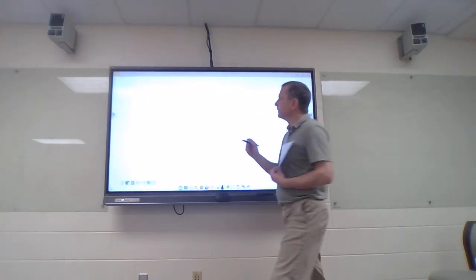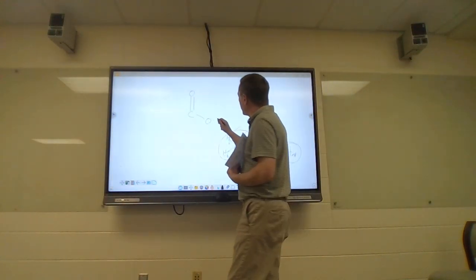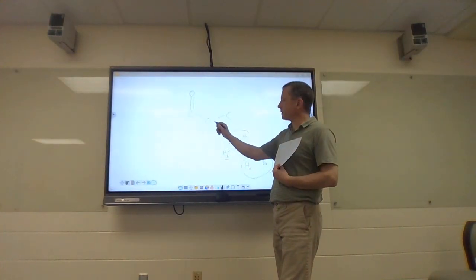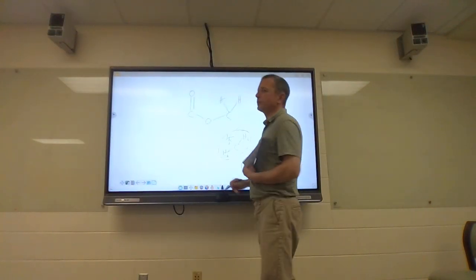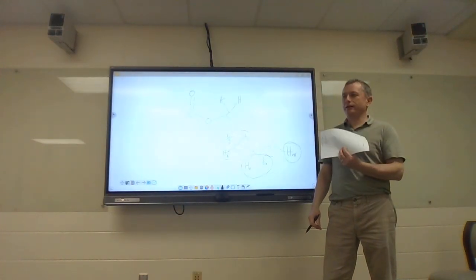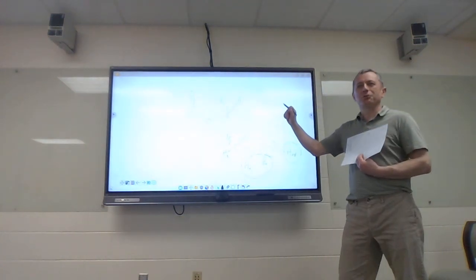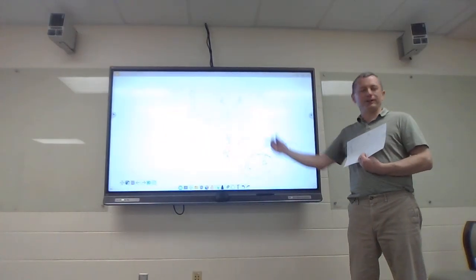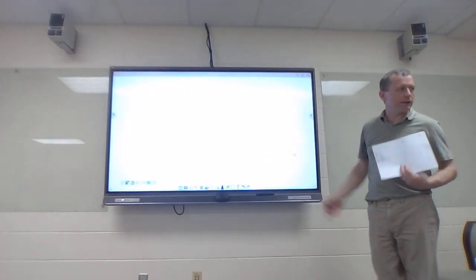If you look at your chemical shift table, hydrogens on a carbon next to an oxygen, next to an ester here, are almost always right around 4. Kate's gotten to see that quite a few times, except it's not this, it's a methyl. So we tend to see a big singlet around 4. That's our ester. We know that every time. It's always there right around 4. It shifts a little bit here and there, whether it's next to a double bond or something else like that.